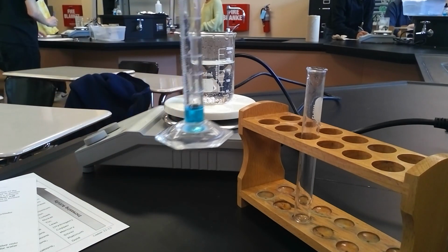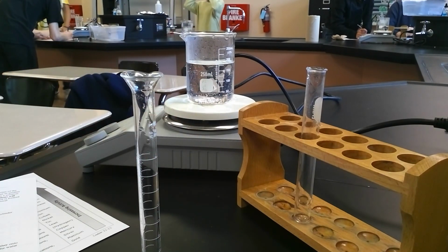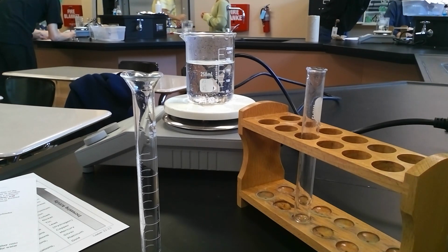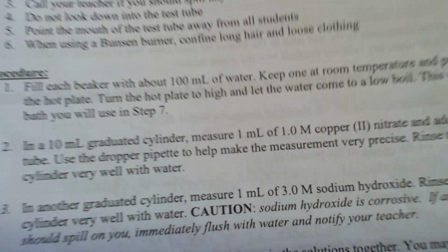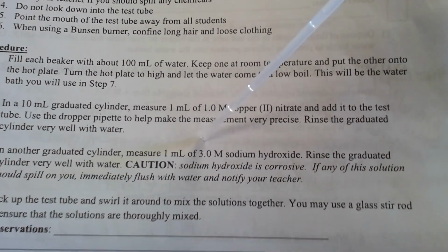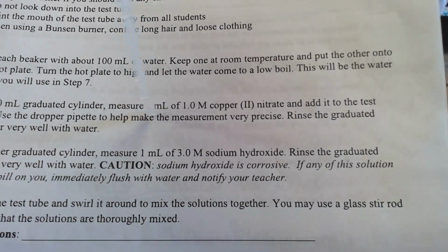1 milliliter is a really, really small amount. When you're holding it like this, it might wiggle, it might tilt a little bit, and you can't tell very well. So you have to actually get down to eye level to do that. And then in another graduated cylinder, I'm going to use sodium hydroxide. This kind of confused a lot of students because the molarity is listed on your lab. This one says, in another graduated cylinder, measure 1 milliliter of 3.0 molar sodium hydroxide. That 3.0 M tells us how strong the sodium hydroxide is, but that is not a volume. The volume is still going to be 1 milliliter.